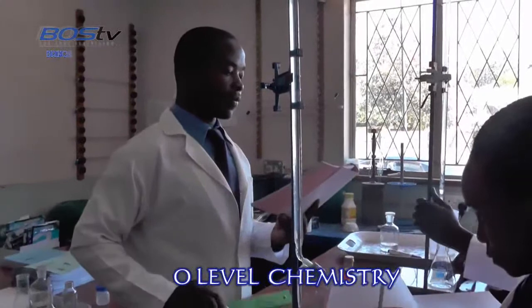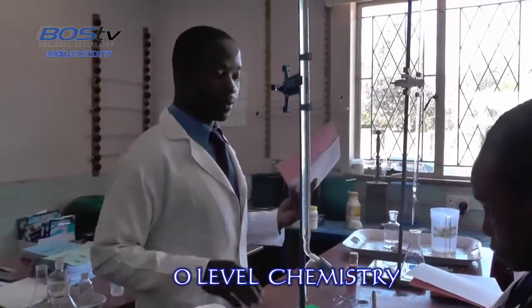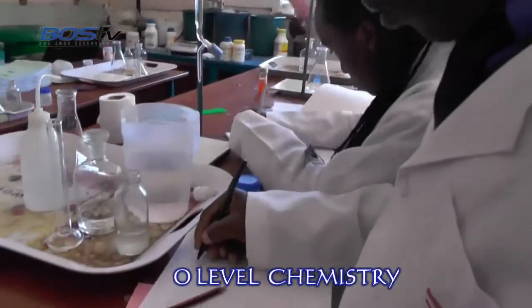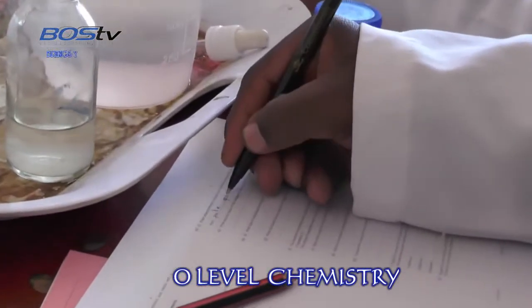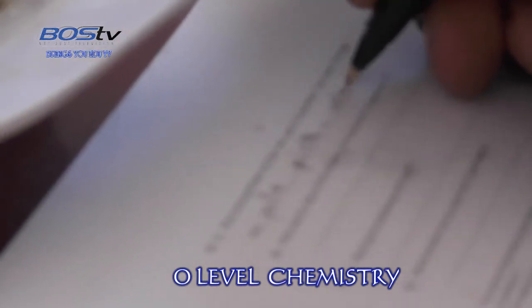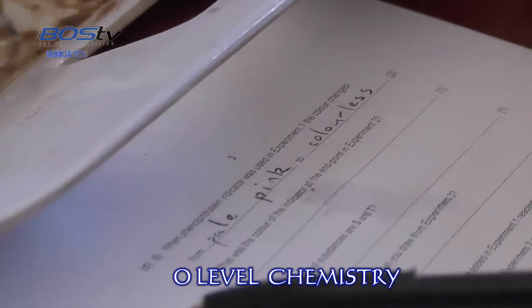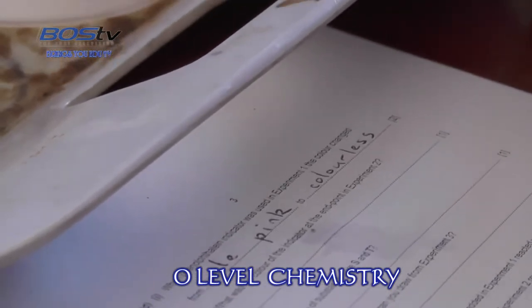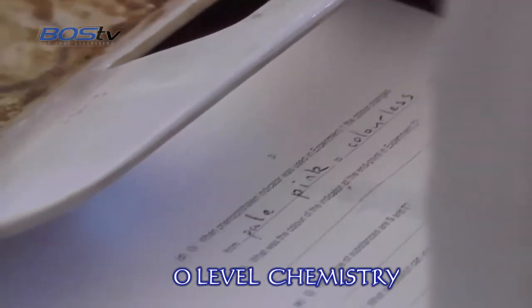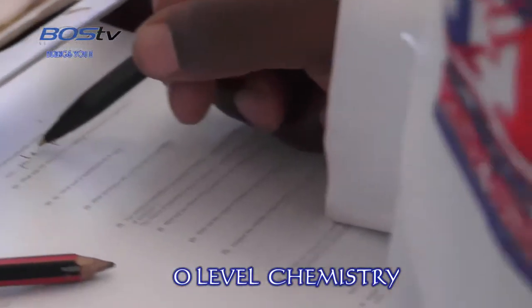Question D, item 1. When the phenolphthalein indicator was used in experiment 1, the color changed from what to what? You noted the changes that you observed when you added phenolphthalein. The color changes from pink to colorless.